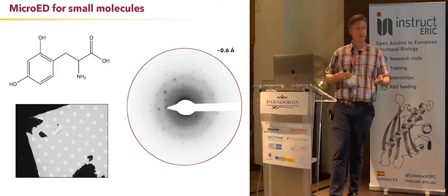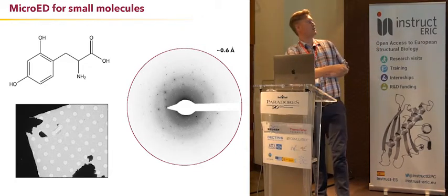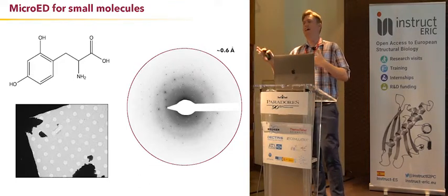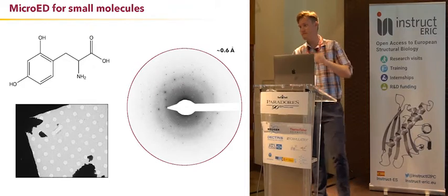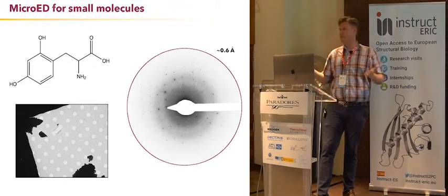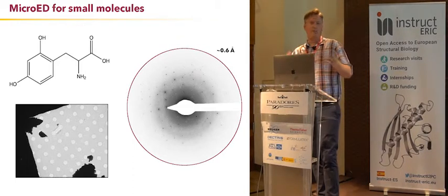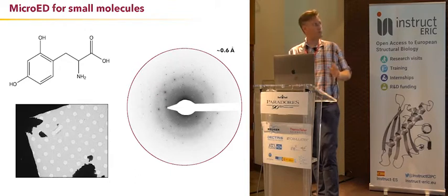They took it to the NMR expert, and the NMR expert said, oh, you've basically got this weird thing where this beta carbon is not here, but rather it's over here. So the beta carbon's gone and replaced the hydrogen on what would normally be the amino acid backbone right here. And they couldn't understand how that would happen, and so they kind of went back and forth with the NMR guy. So I said, well, why don't we just take the sample?